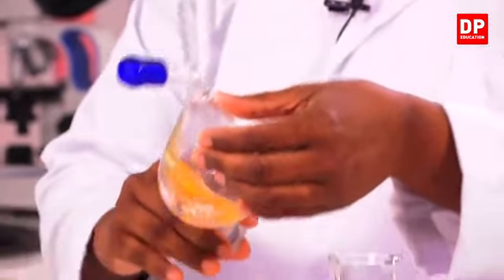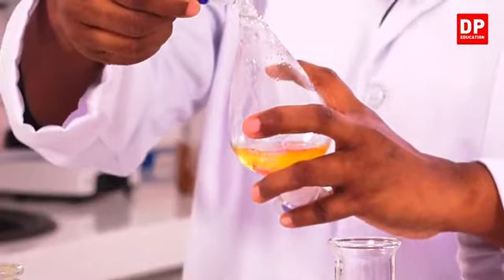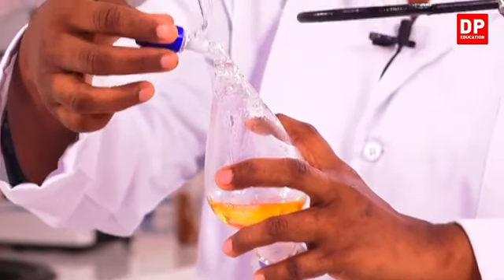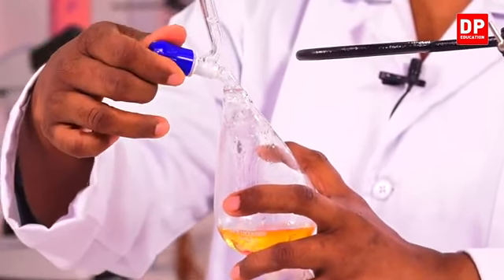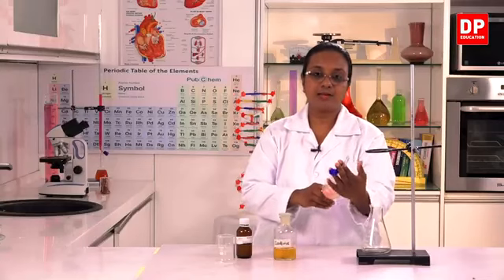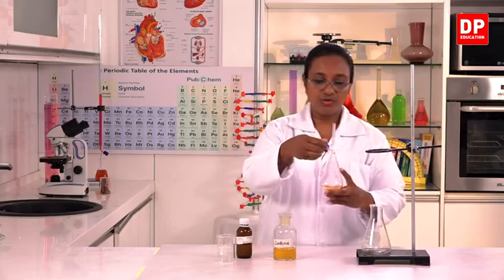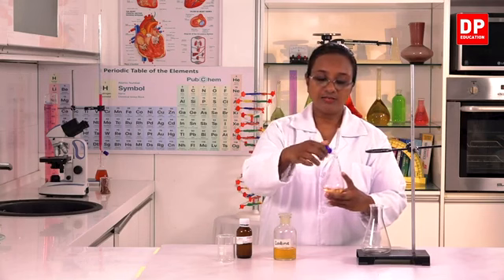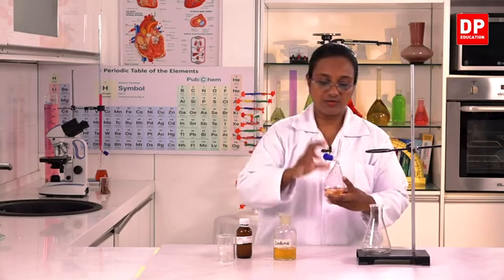separation funnel and mix it in this way, and also we have to open the tap a little bit in order to release the pressure. Again we close and we mix it in this manner. This is the technique that we use to mix the two solvents in the solvent extraction process using the separation funnel.